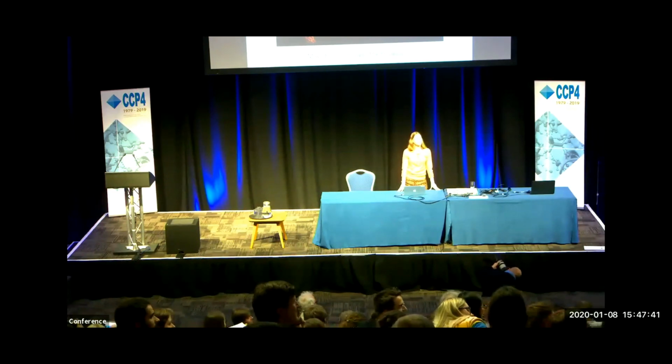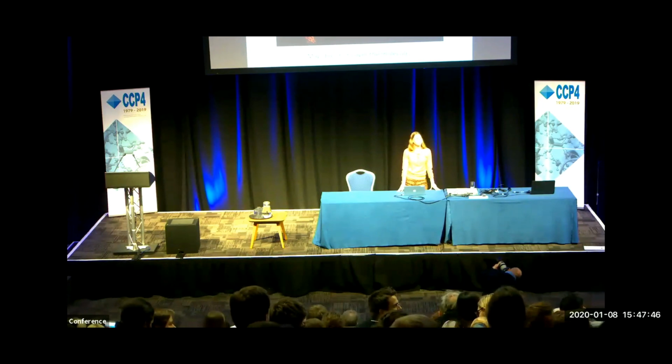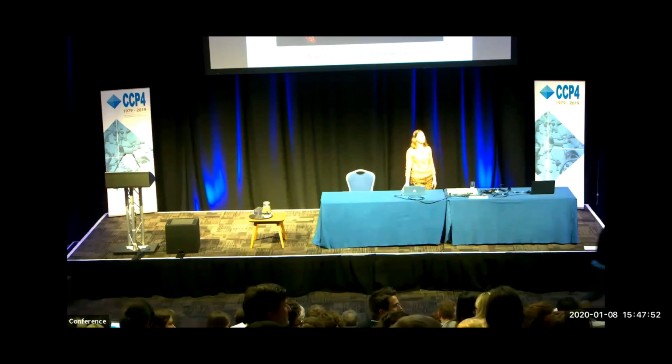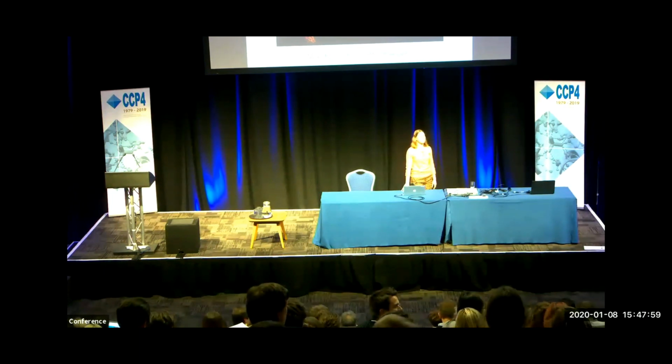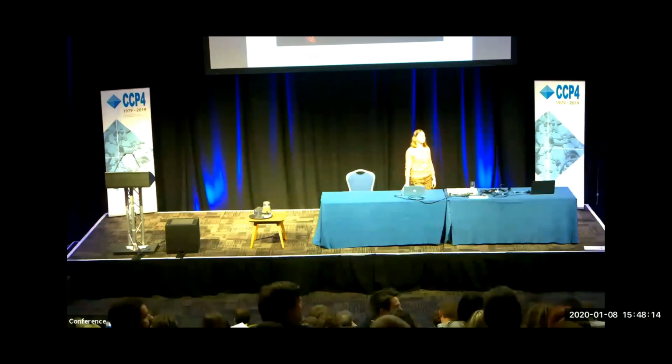Yes, we're well aware of that. The deposition system for EMDB and PDB is the same one. They both come through OneDep. We are just about to roll out EM validation reports, which would include analysis of this sort of thing, so volume inclusion, looking for where the map and model disagree. This is available to depositors now, if you deposit a new structure, and will shortly be available to everybody in the full archive in both PDB and EMDB archives. Okay, thank you.